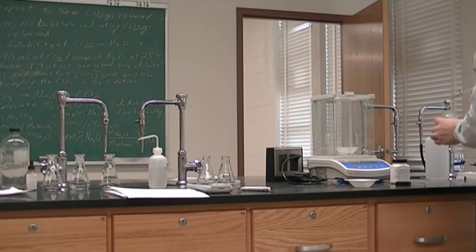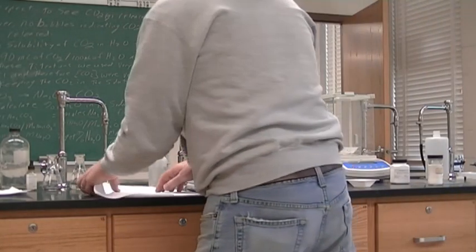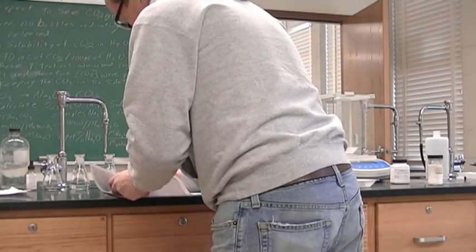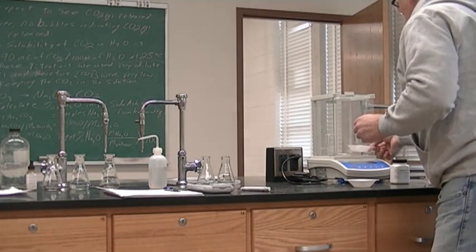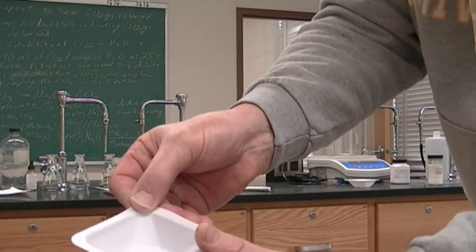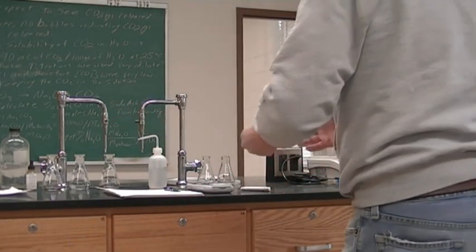All right, so we have 0.1075 grams. And so it is a very small amount. I don't want to tip it up too much, but it is a very, very small amount.